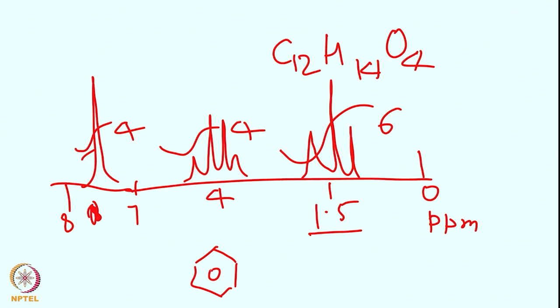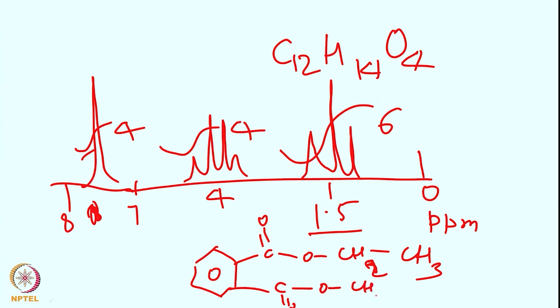So, that means now these methyls, and there is also something called a methylene group. So, probably there is a structure which will be something like this. Because now methylene groups will come here, that are 4. So if you look at 2 to 4, this will be 6, and this corresponds to 4 protons.